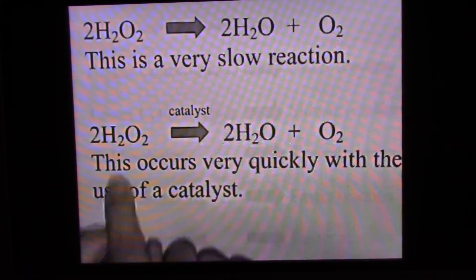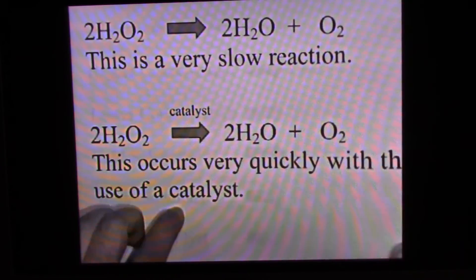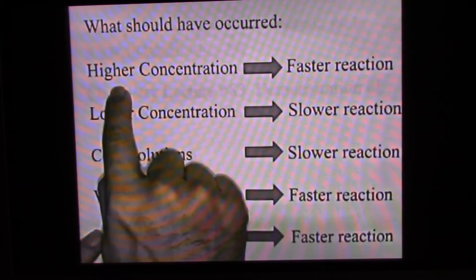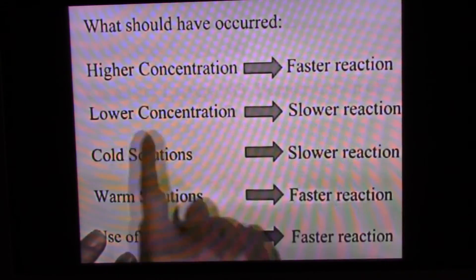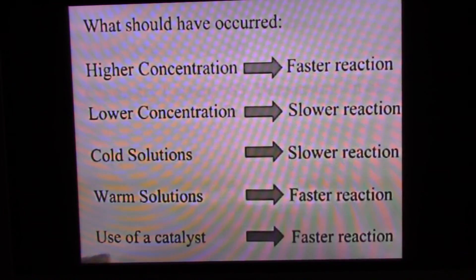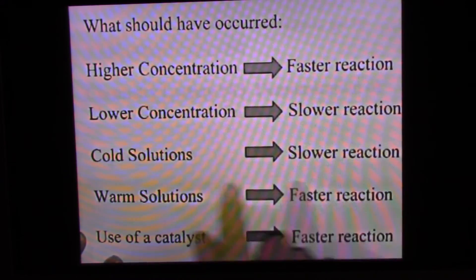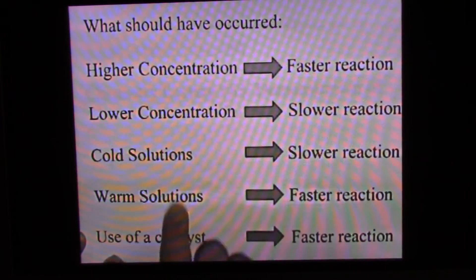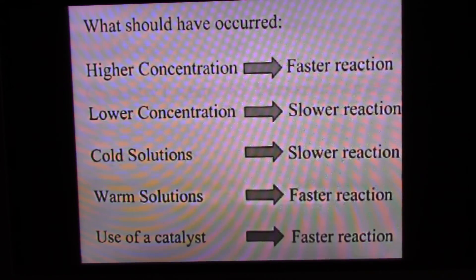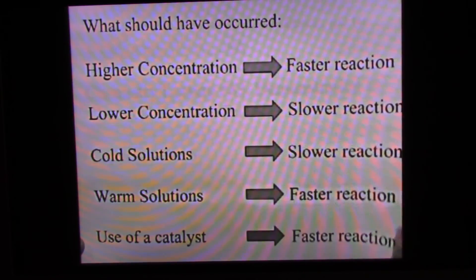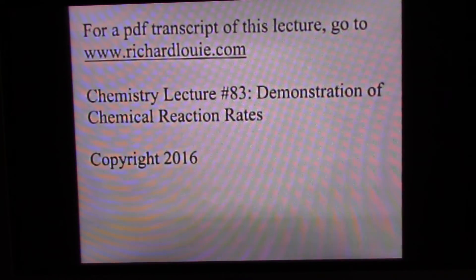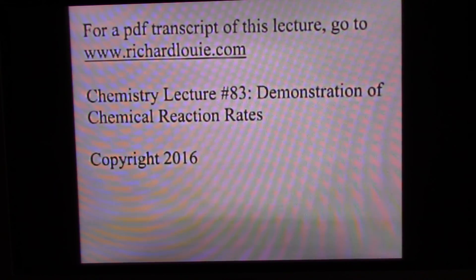Let's go over what should have occurred. At higher concentrations the reaction occurs more quickly; at lower concentration it goes more slowly — and that occurred. The cold solution didn't quite work, but with the warm solution we did get a faster reaction, and the warm solution was faster than the cold solution. The catalyst with the hydrogen peroxide actually worked. For a PDF transcript of this lecture, go to www.richardlewy.com. This has been Chemistry Lecture Number 83, Demonstration of Chemical Reaction Rates.